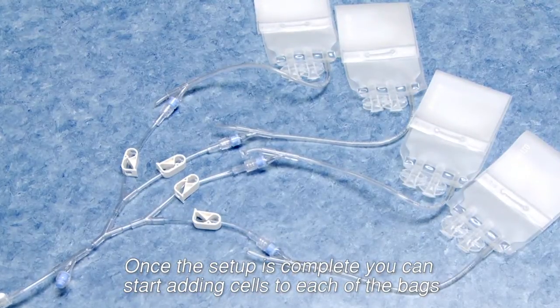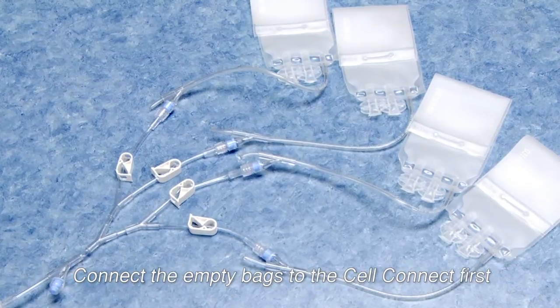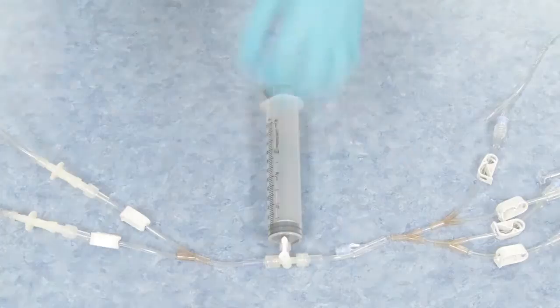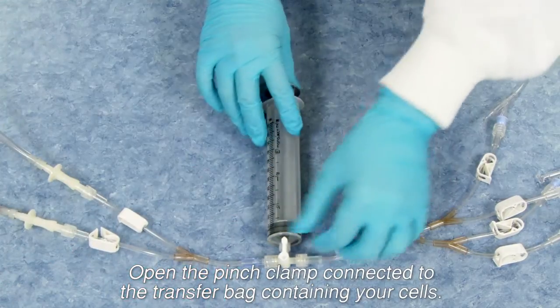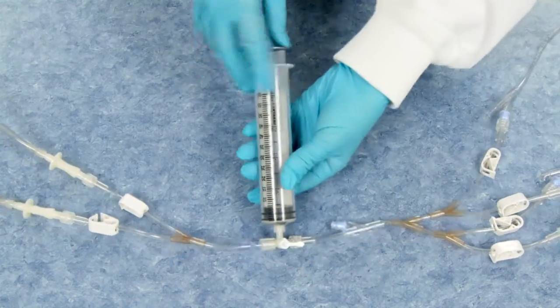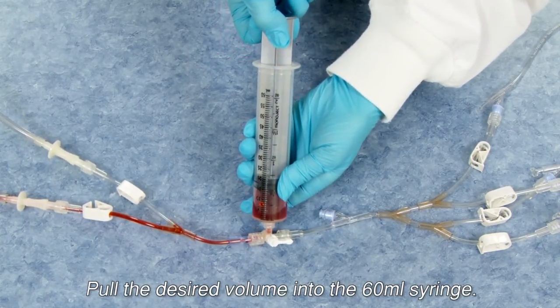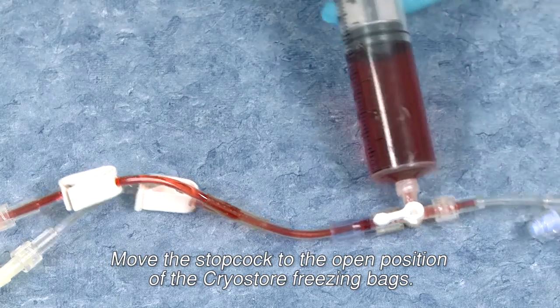Once the setup is complete, you can start adding cells to each of the bags. Connect the empty bags to the CellConnect first, then spike or sterile connect to your freeze media and cells. Open the pinch clamp connected to the transfer bag containing your cells, and pull the desired volume into the 60ml syringe.